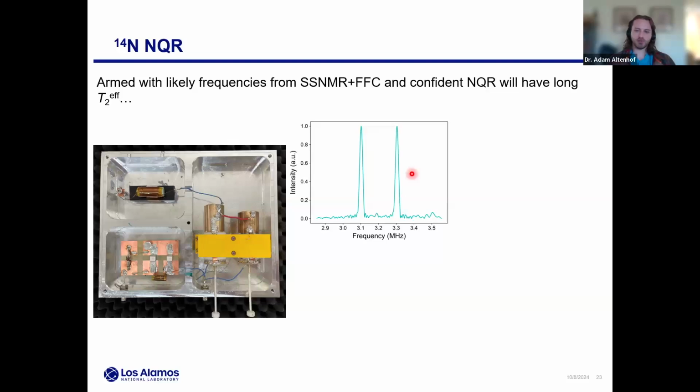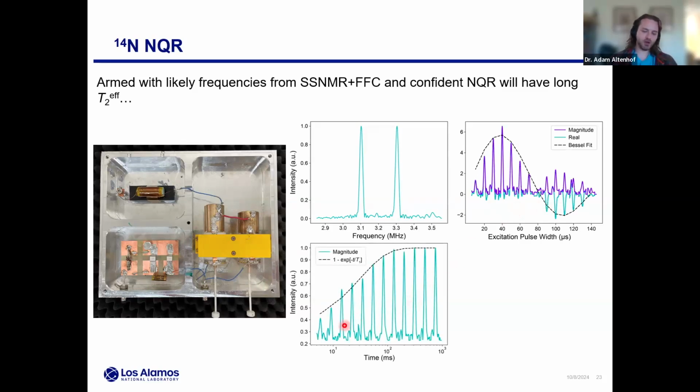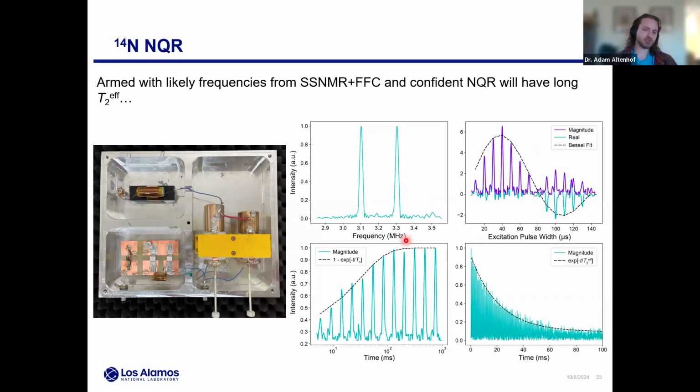And we get pretty paranoid working in this low frequency world, to make sure these aren't interference or what have you. So we run through the gambit, where we run a nutation. We see this expected NQR damped oscillation. The NQR line should have a T1, and we can measure that with saturation recovery. In every case here, we're using CPMG to measure the signal. It turns out the T2 effective is actually quite long, giving us a really nice SNR boost and speeding up the acquisition just at room temperature. So definitely very fortunate for the good relaxation times here.